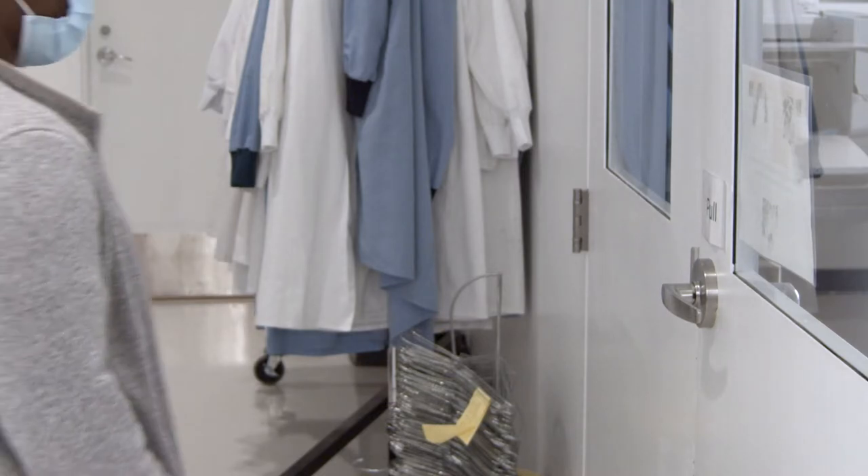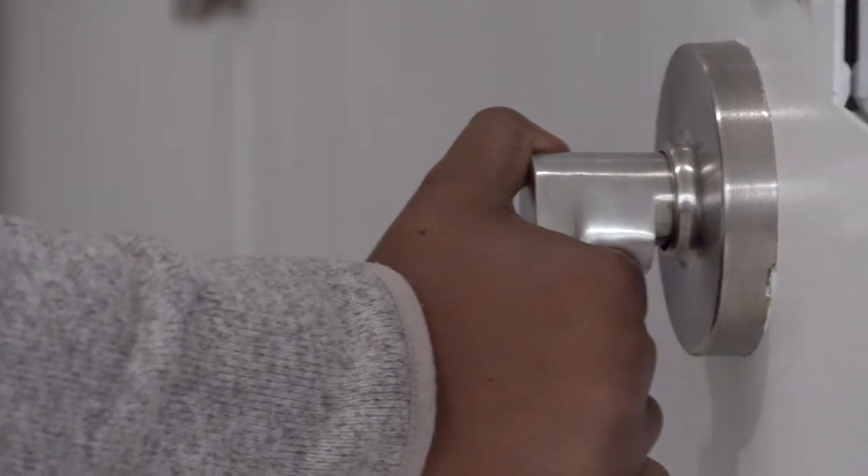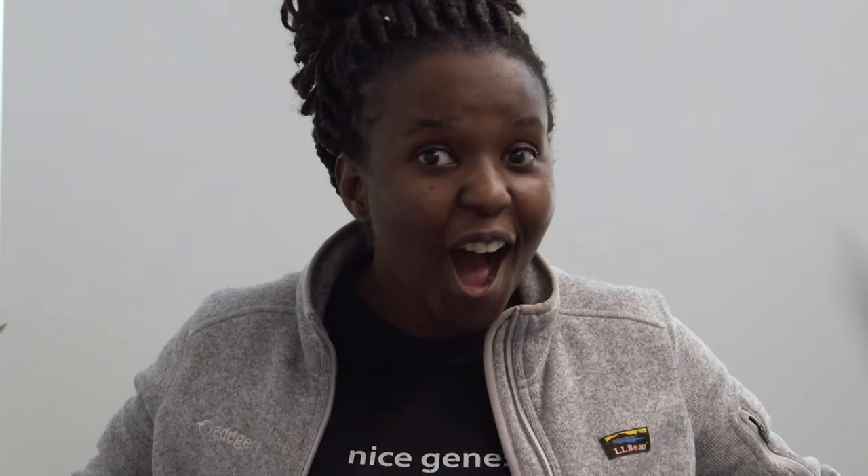When you need to leave the laboratory and you need to touch a door, make sure that you remove your glove from one hand and open the door with your bare hand. And please do not touch your face.